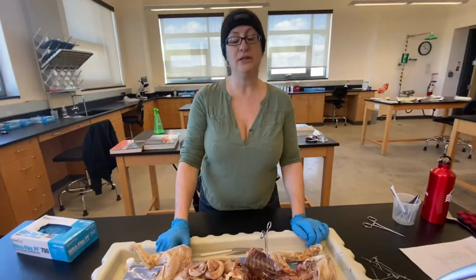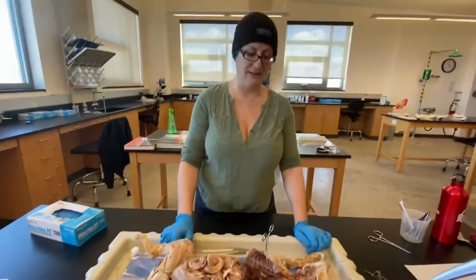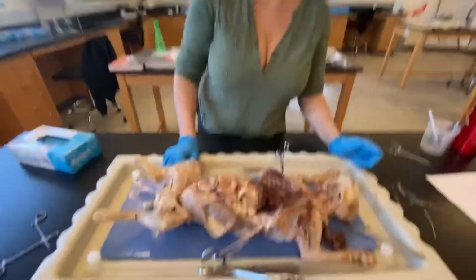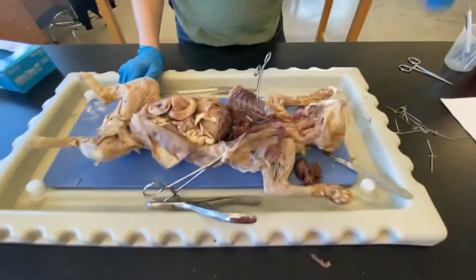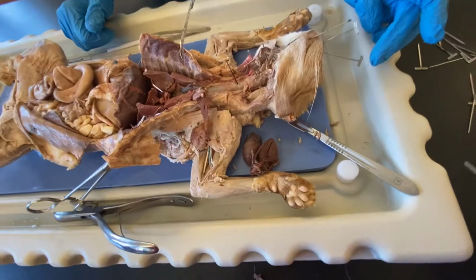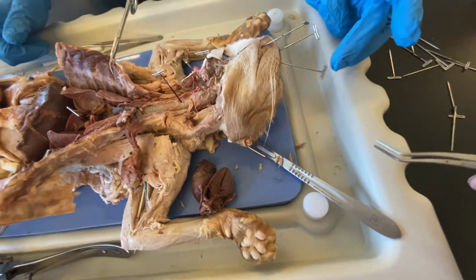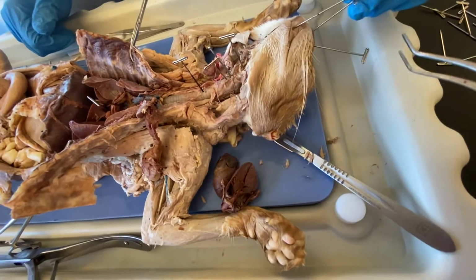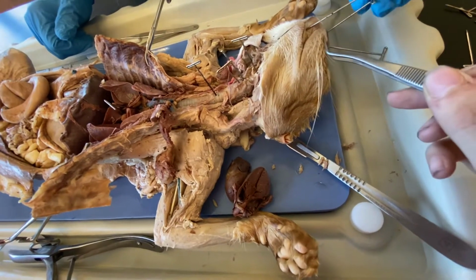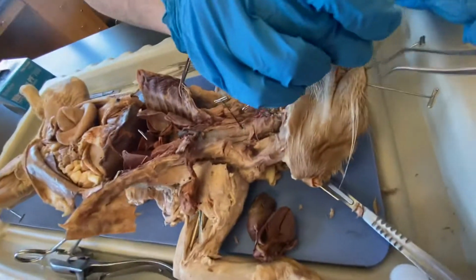Okay, we will be doing the respiratory system on a female feline. So, starting at the most superior points, technically, this is the nasal cavity. We didn't split it open, but it's in there. These lovely little nostril holes that we call the nares. And the oral cavity, obviously the mouth.